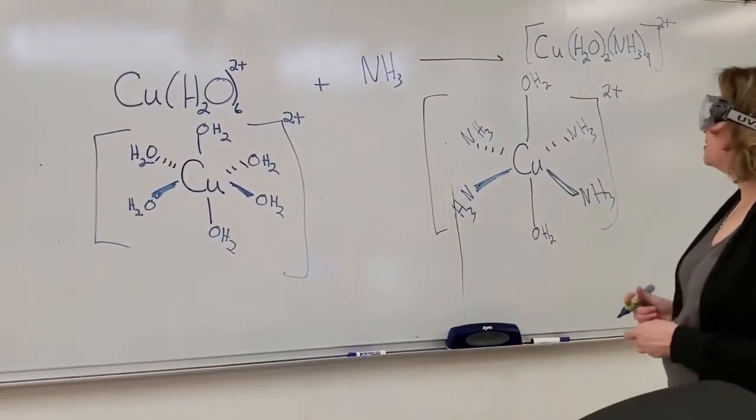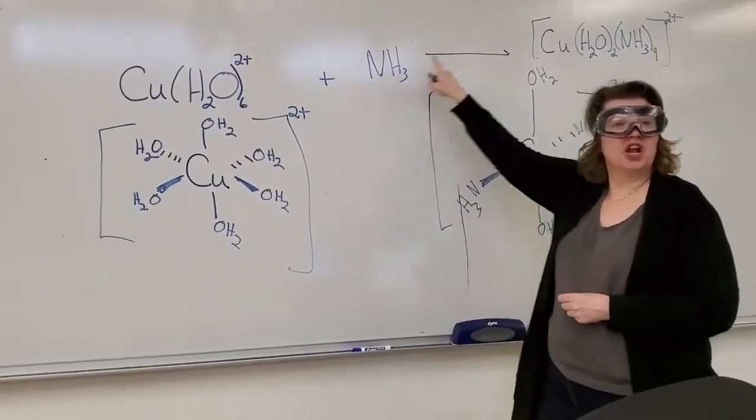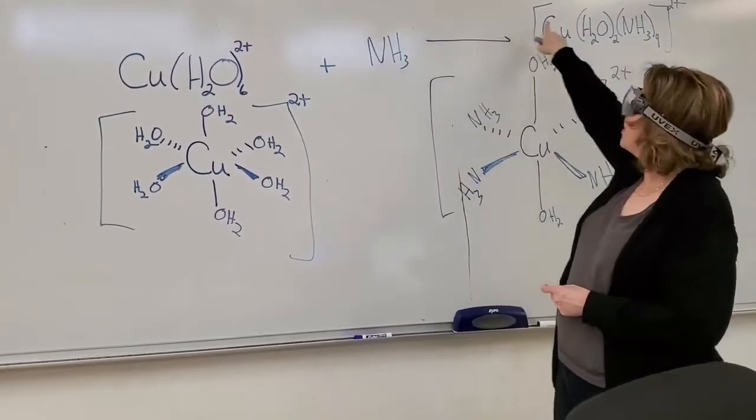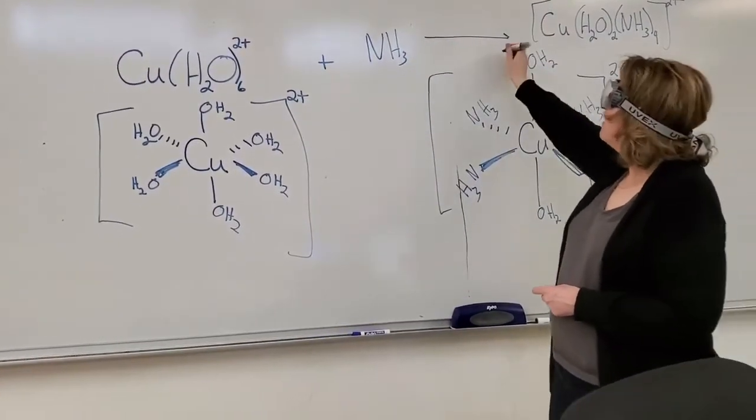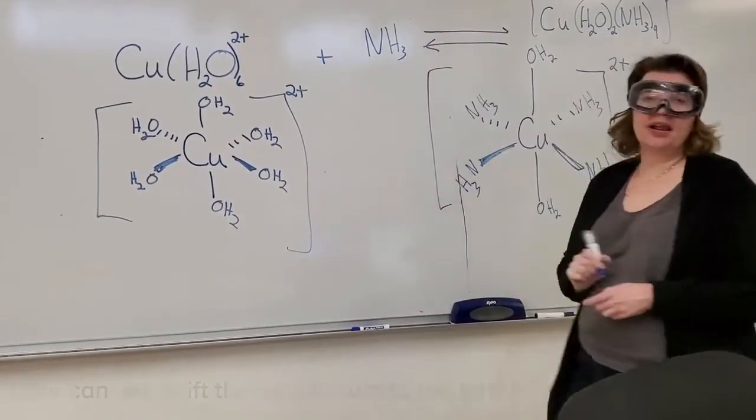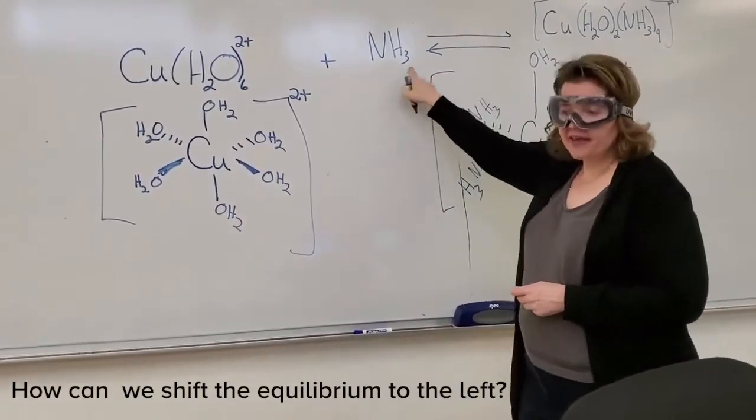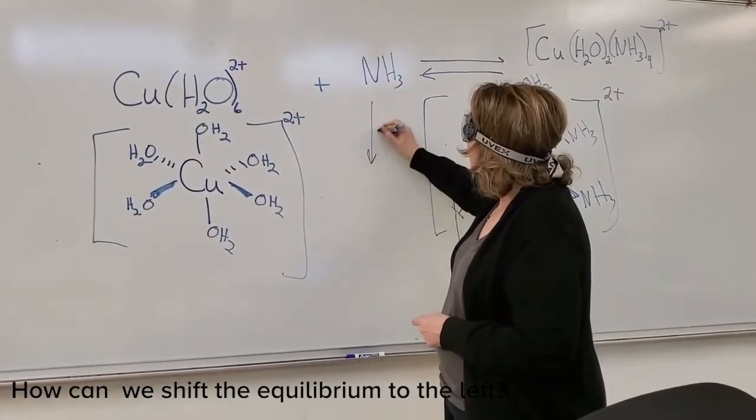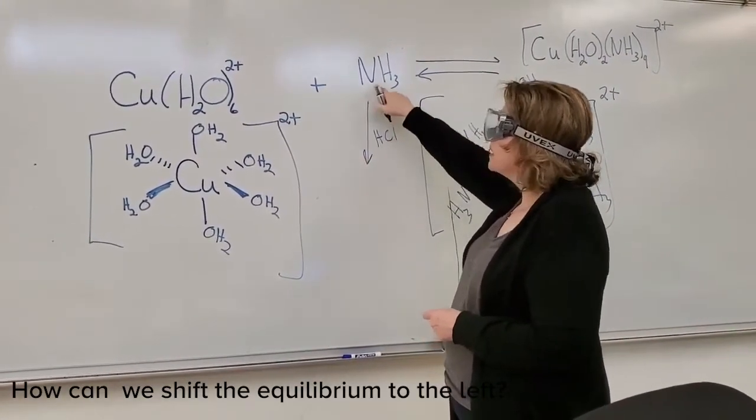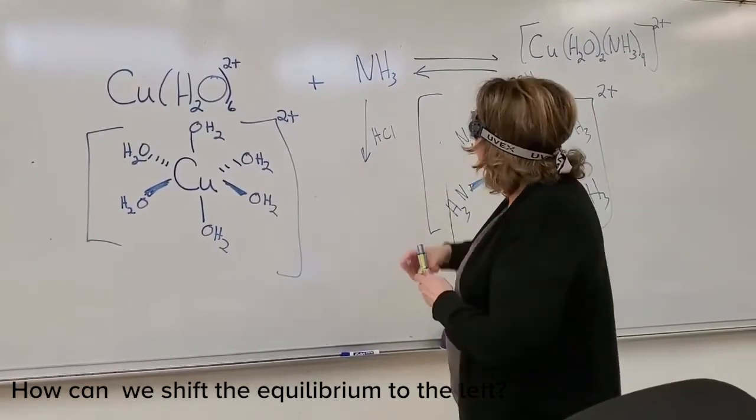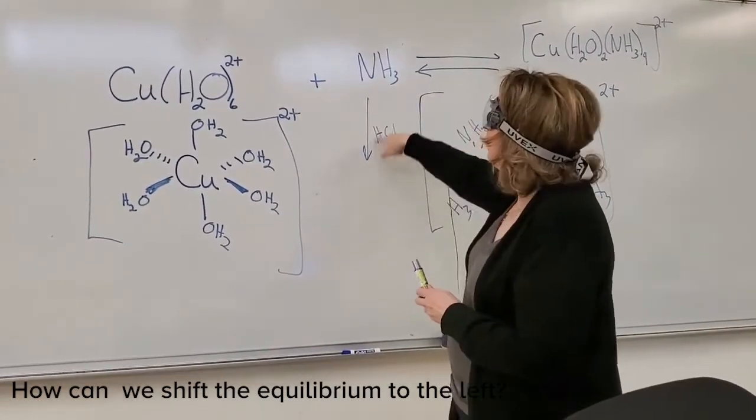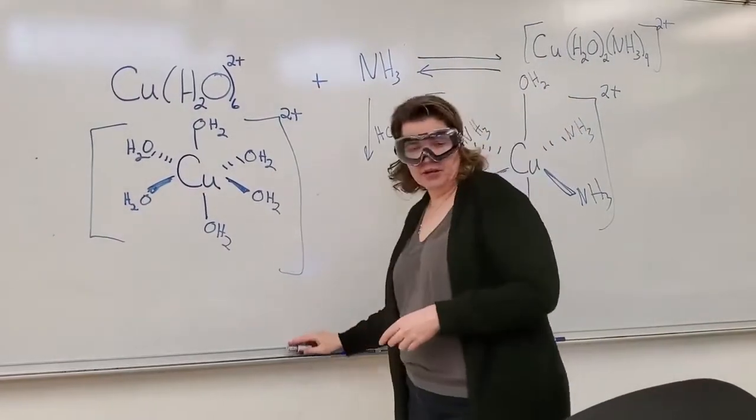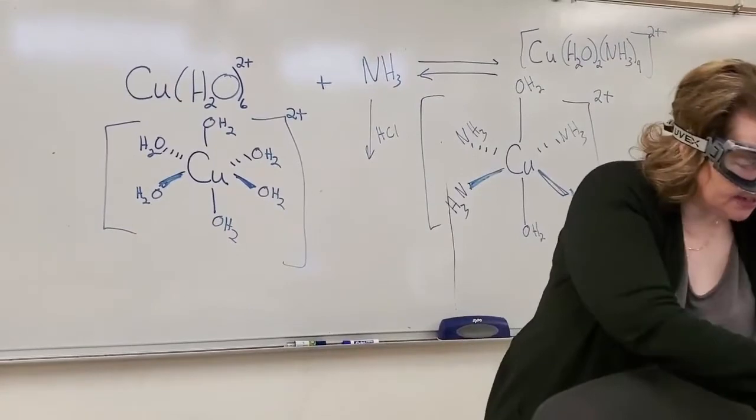So Le Chatelier's principle, I already played with it a little bit to push it all the way to the right. Le Chatelier's principle says if I add extra ammonia, we're going to push the equilibrium to the right. But if I want to bring it back, how can I bring it back? I can bring it back by removing the NH3. The way that I'm going to remove the NH3 is I'm going to add some hydrochloric acid. That's a base and that's an acid. So the acid will remove the NH3, and as the NH3 is removed, we can bring the equilibrium back.